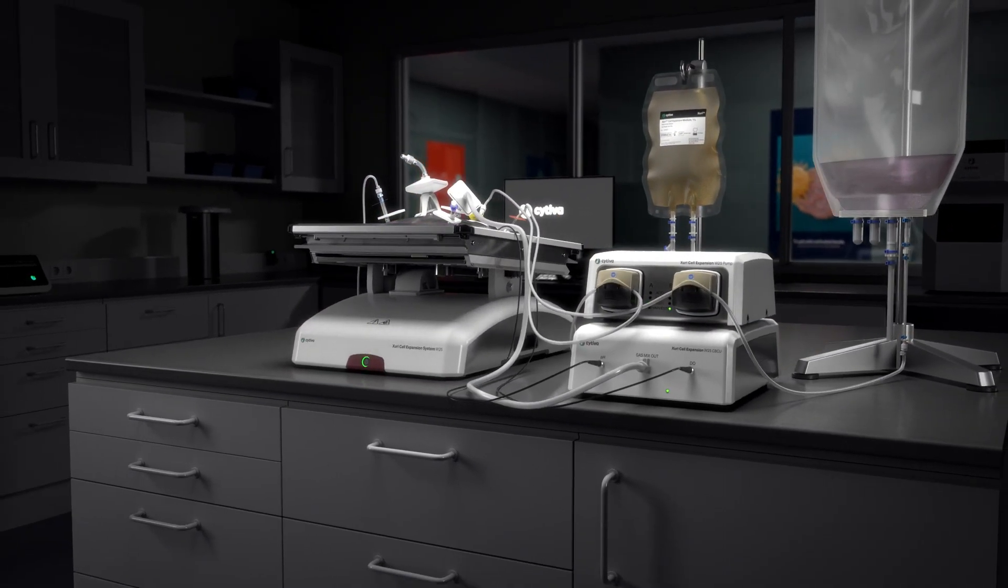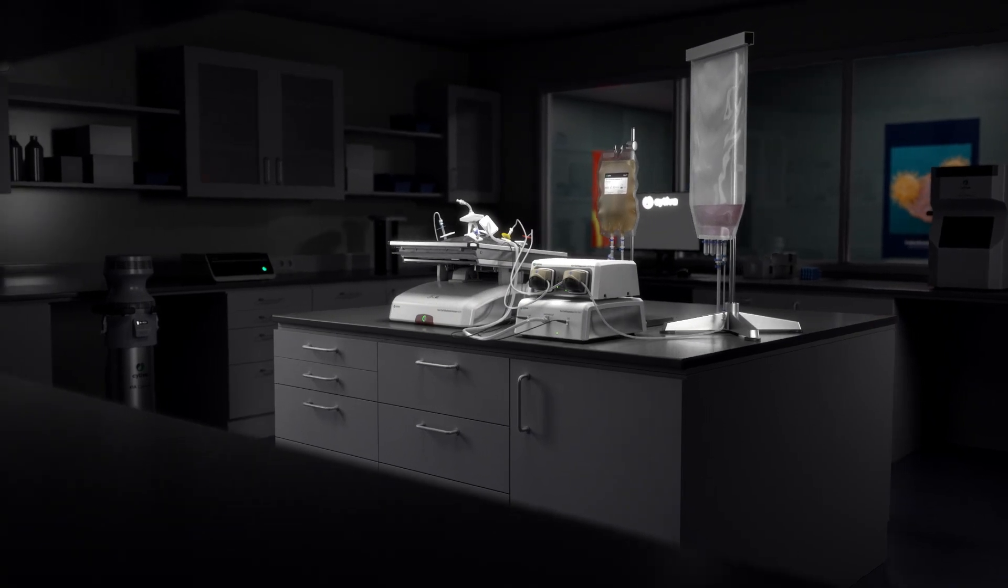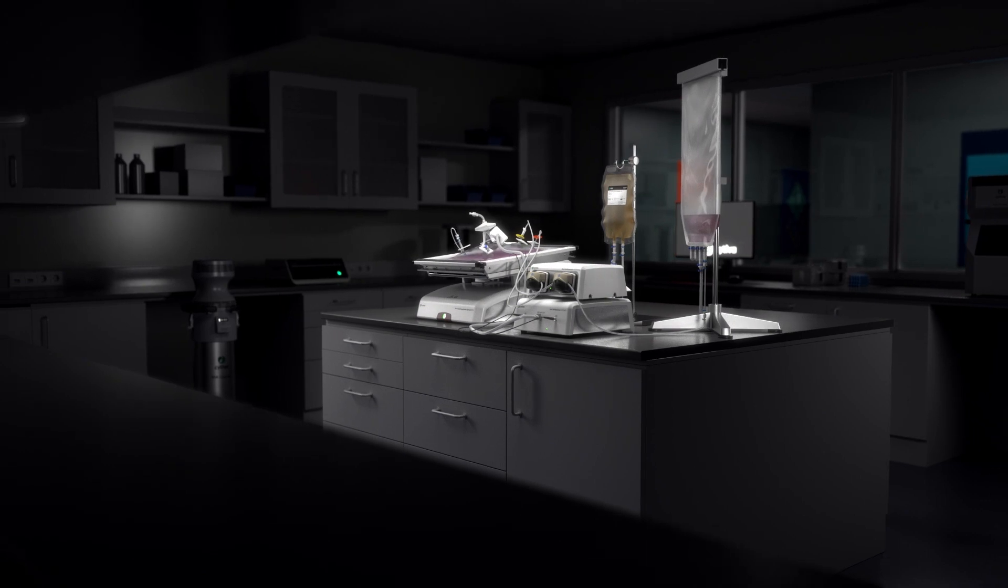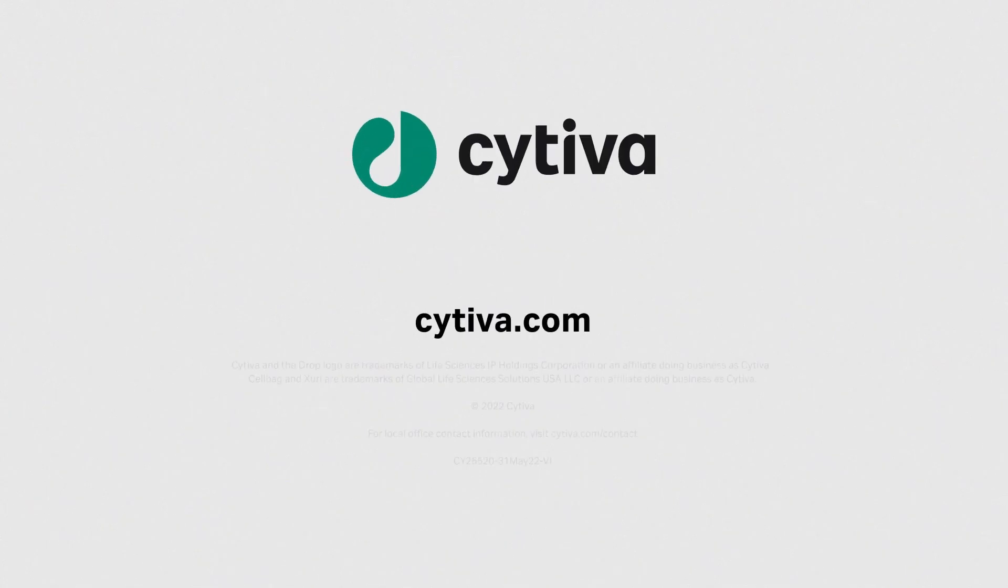Thanks to its scalability and functionally closed process, the Zuri W25 system helps you seamlessly take cells from research to the clinic. Want to learn more? Contact Cytiva for a demo.